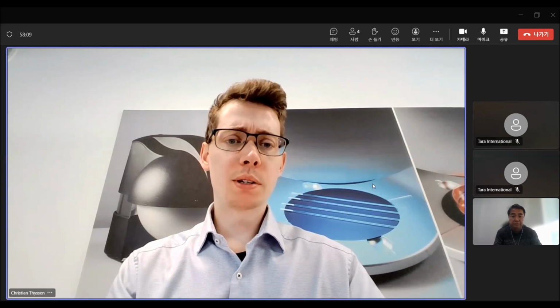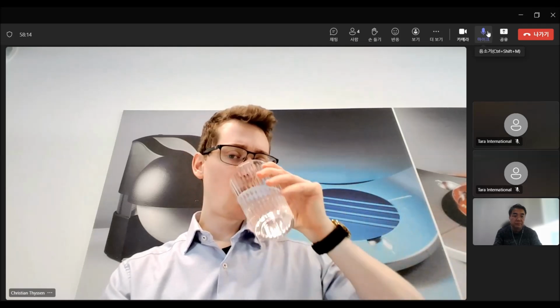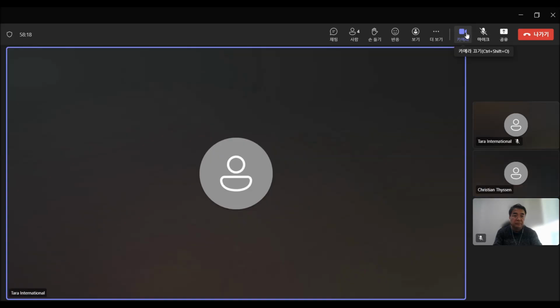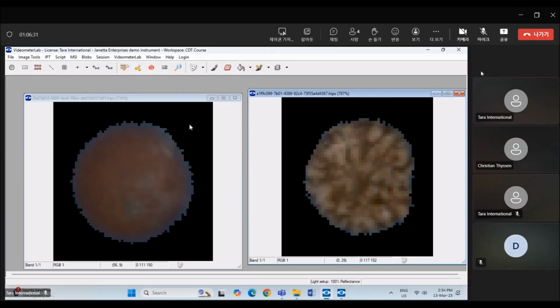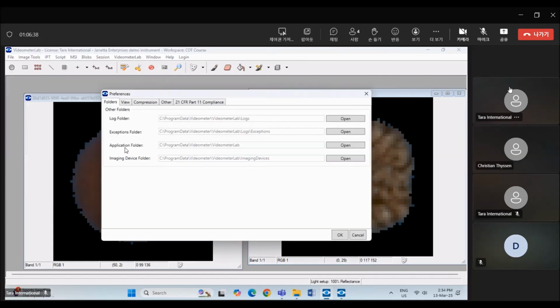How about you, Tara? Are you doing well? Hello. Yeah, we followed through exercises 1 and 2, and we are yet to try the second one ourselves. So we will open the workspace to check the debug image. I've shared my screen, but I couldn't look at the workspace. Okay, yeah, we need to update that.